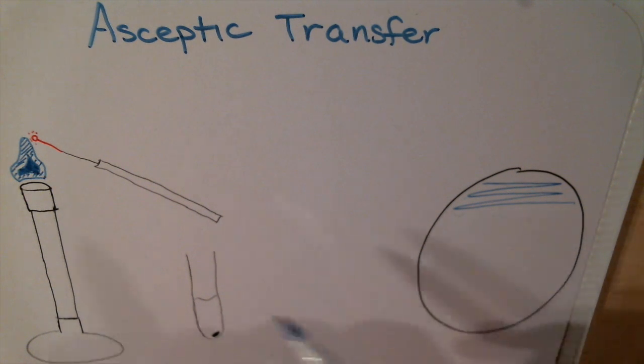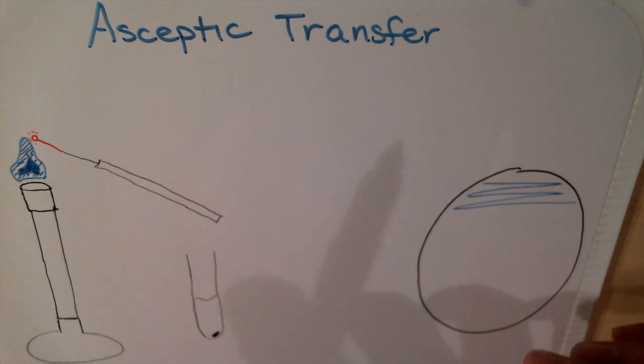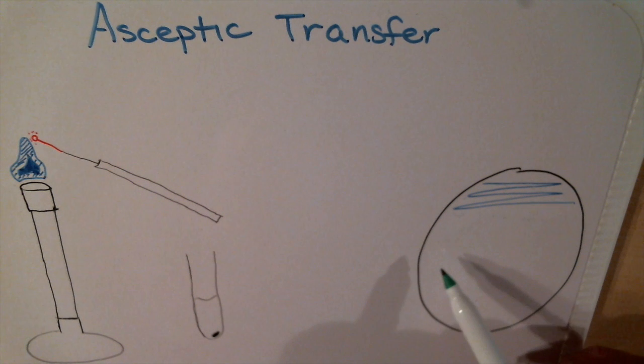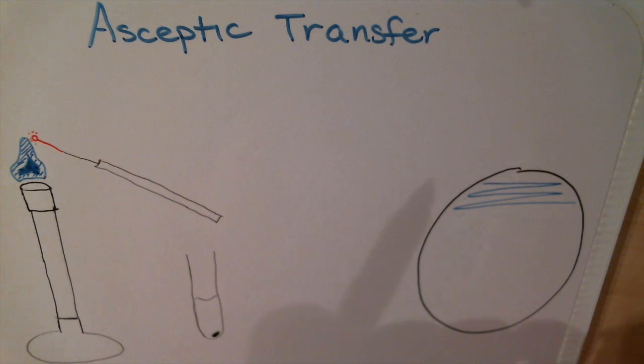Then we'll burn the bunsen burner again until it's bright red and wait for 10 to 15 seconds. If necessary, to make sure that the loop is cooled down, we'll lift the top up again and touch the plastic sides of the inner walls of the plate. If you hear a sizzling sound then it's still too hot. If you don't hear anything, then it's good to go.